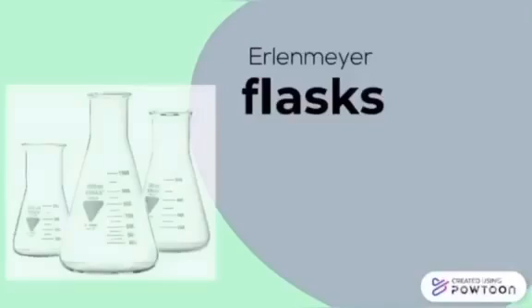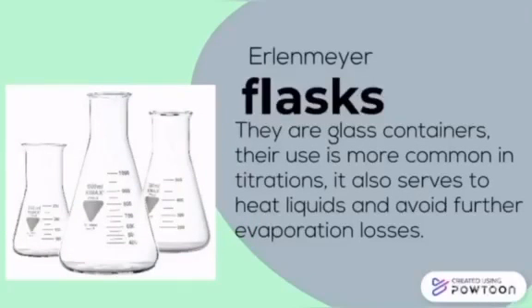Erlenmeyer flask. They are glass containers. Their use is more common in titration. It also serves to heat liquids and avoid further evaporation losses.